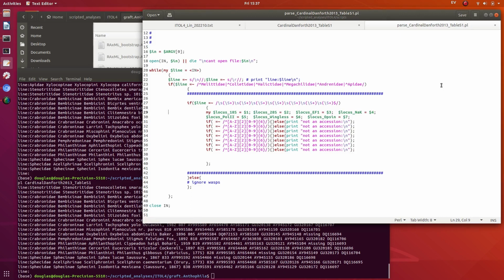Now I'm going to just check each entry and see if it looks like an accession. If not, then print it. So NCBI accessions usually start with A to Z, uppercase, maybe 2 of these, and then about 6 numbers, but this is not always exactly like this. So I'm going to check for this format.